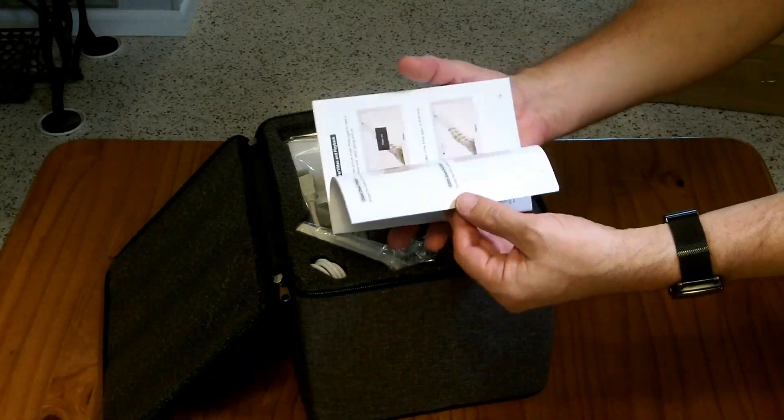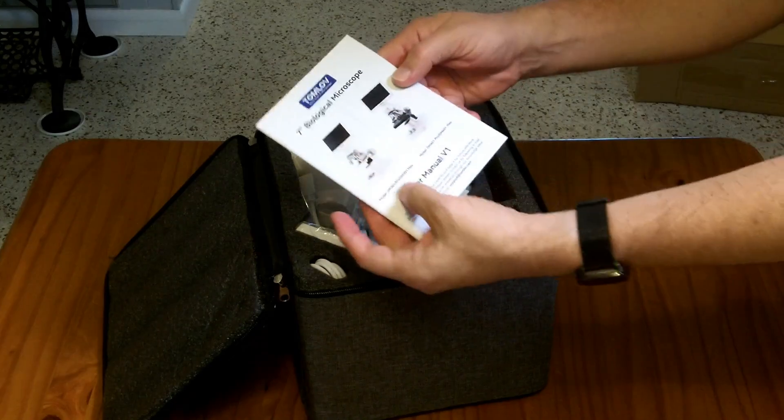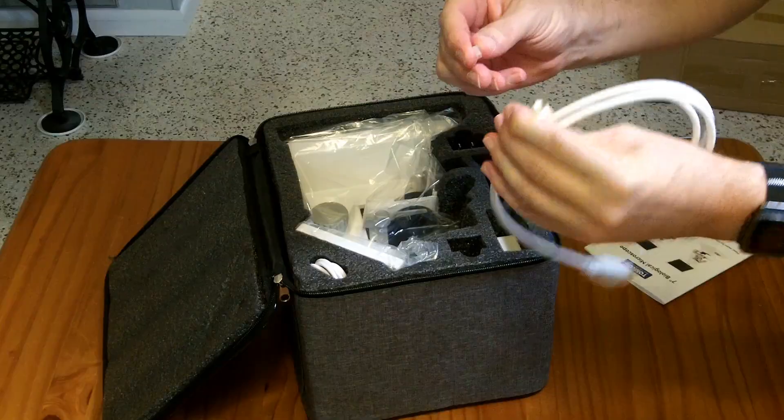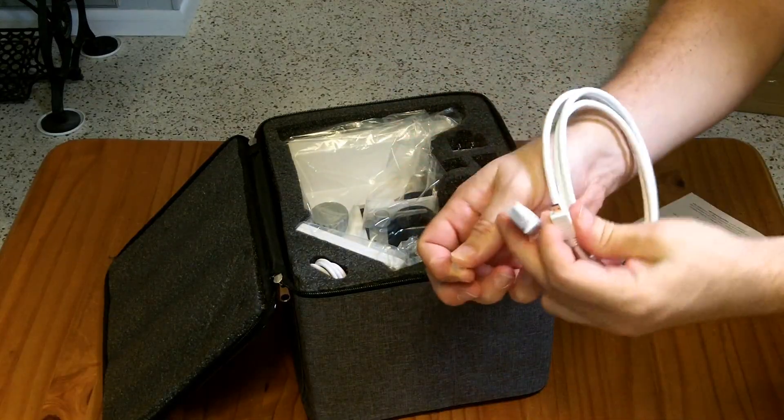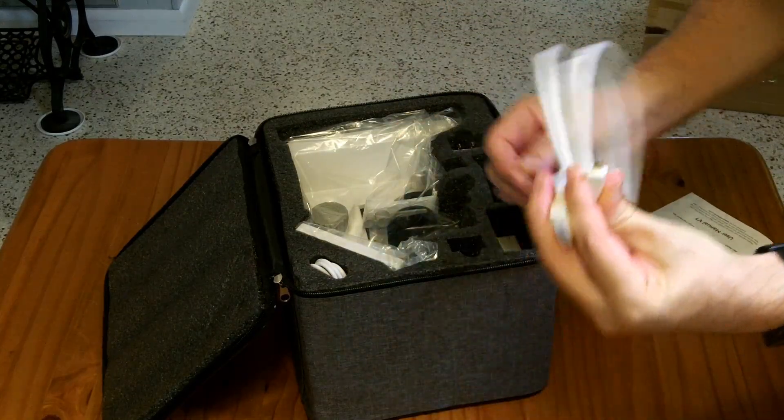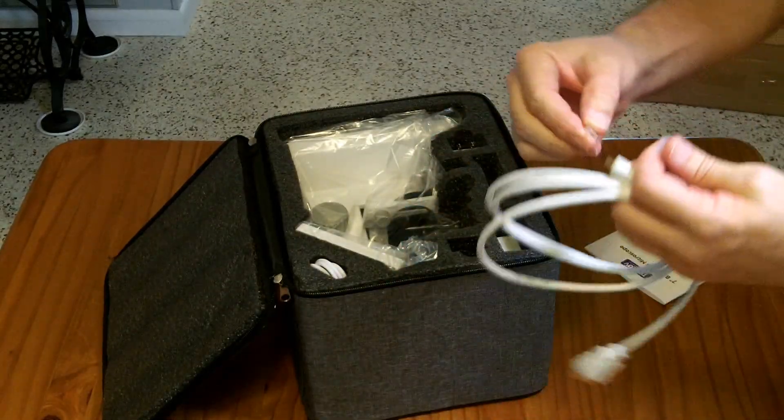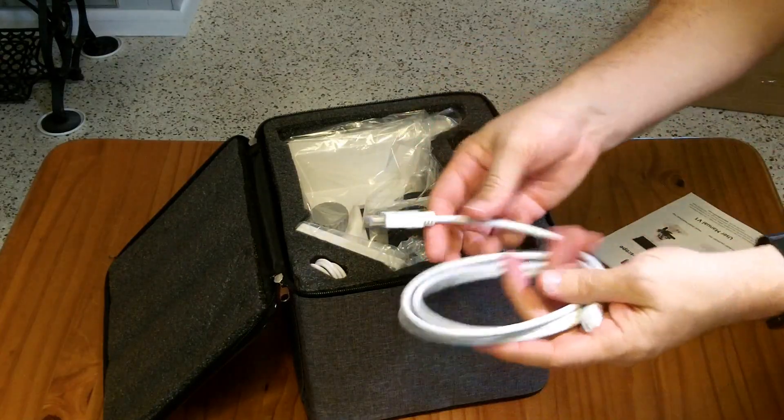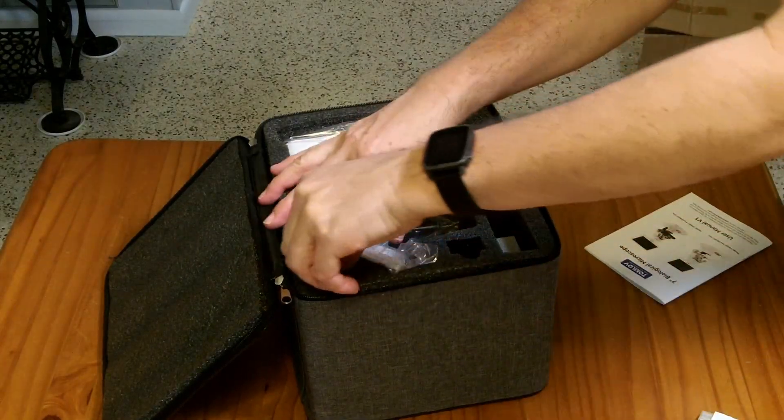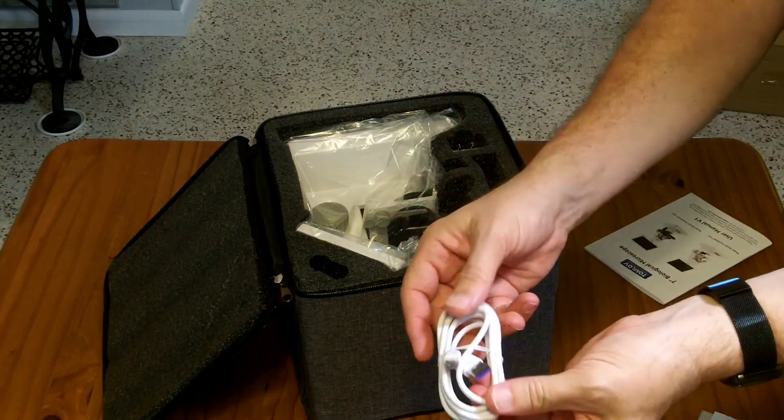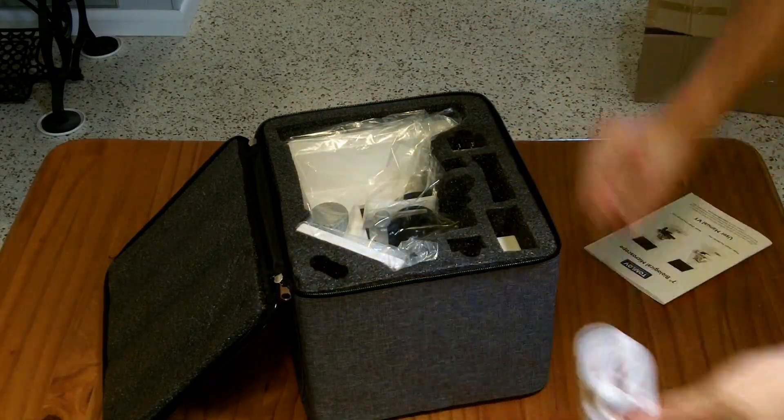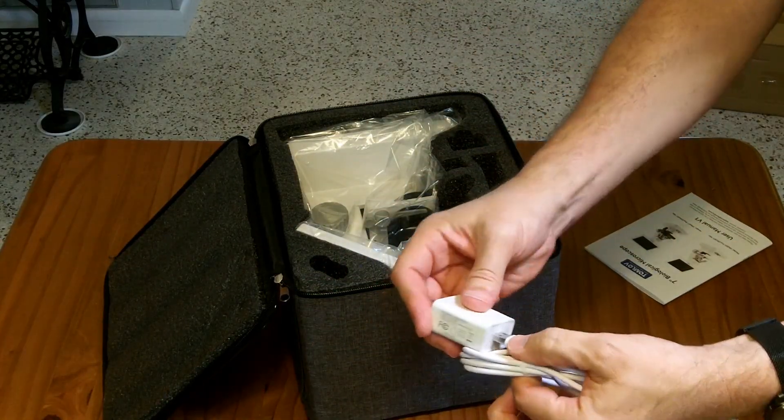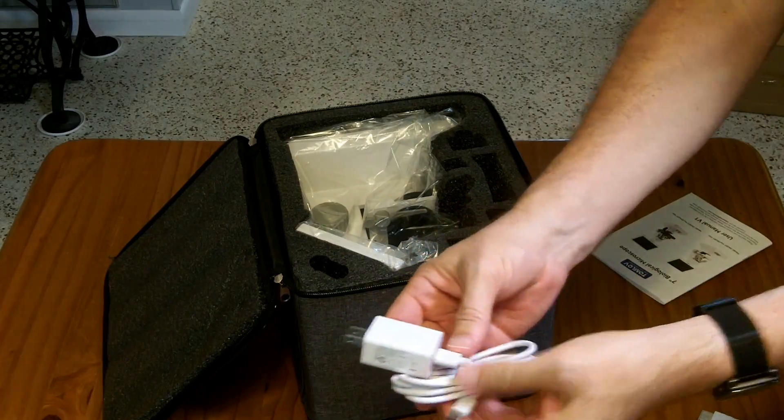It tells you basically how to use the microscope and the 7-inch screen. It comes with a HDMI cable, this looks to be a micro HDMI to HDMI cable for taking the output of the display and putting it up on a larger monitor or television. There's also a USB-A to C cable, which might be for charging or power. There's the power adapter here, which is probably to plug into this USB-A cable to power the microscope and its lights.